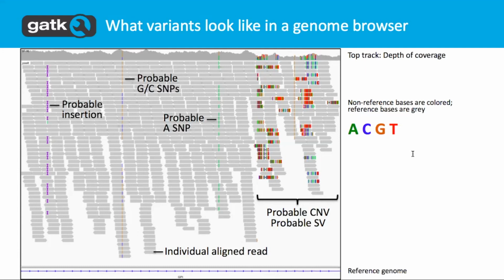There's no example of copy number variation, but the general idea is that if you have a copy number variation, you expect some change to the coverage profile, and there's your coverage profile for the sample, right? Coverage distribution over these bases, and you expect that if you have, for example, a homozygous deletion, your coverage will just drop to zero, and if you have a heterozygous deletion, it will be roughly half. It's much more difficult to see from exome samples because the coverage profile is really non-uniform.